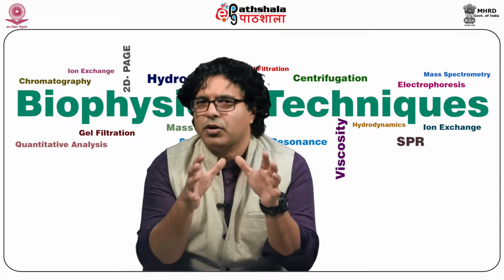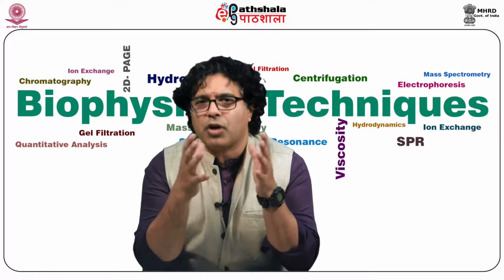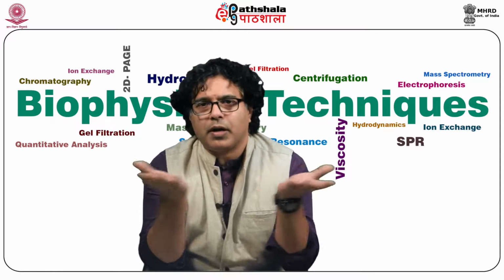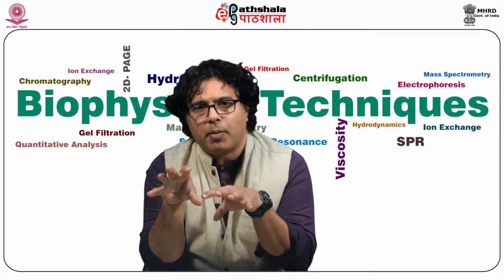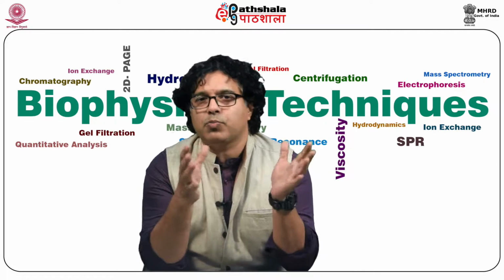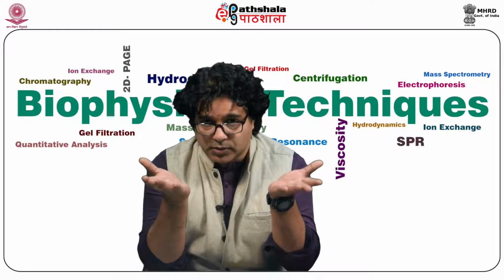Sometimes it's very difficult to comprehend what type of reactions are happening inside, because this is happening in an exotic condition which never happens in your lab, on your experimental table. Therefore, we could only explain that based upon the fragments which are getting formed. We try to explain what would have happened. This gives us a much better understanding about what's happening inside the fragmentation process.